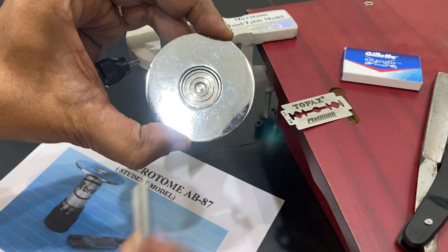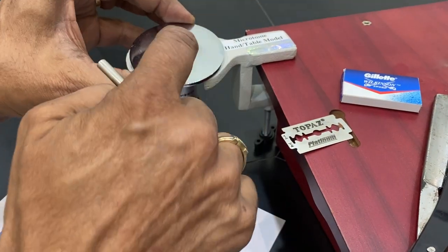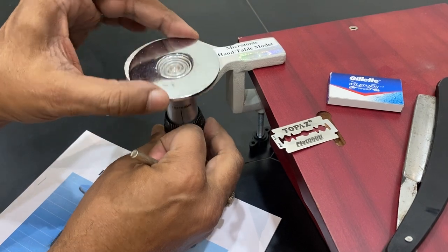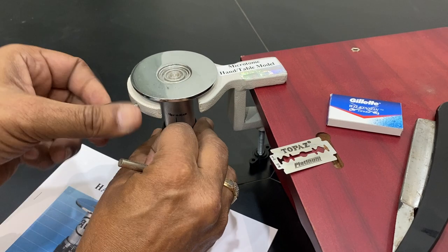See, these lines and circles are there. Put molten wax and put the sample block here. Then you can adjust it if you want to cut the sample.